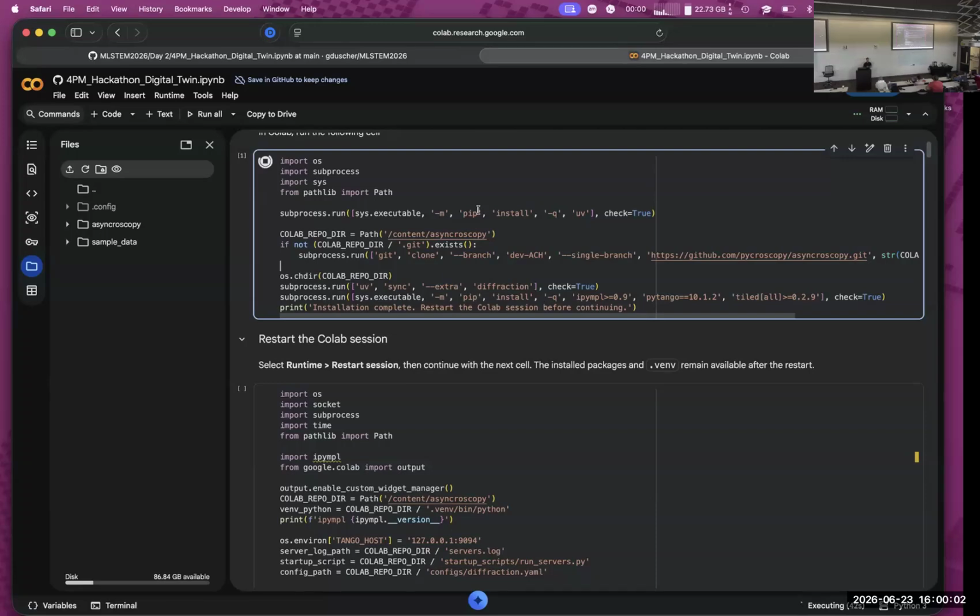So I'm going to run you through the first few cells, and then there's a problem statement at the end, and everyone will be turned loose for an hour.